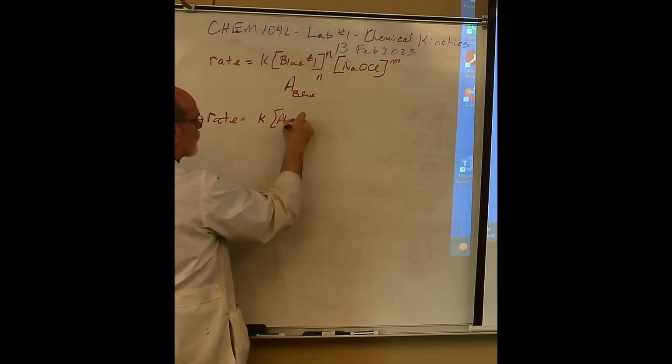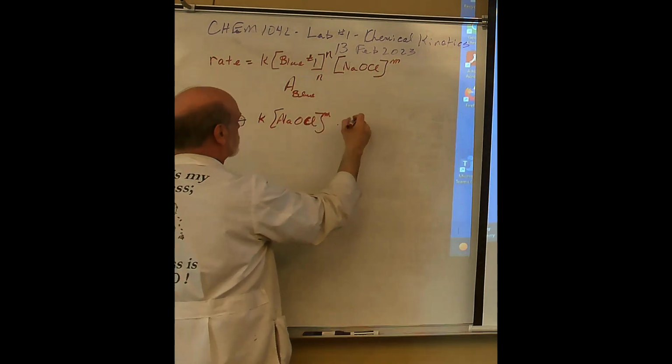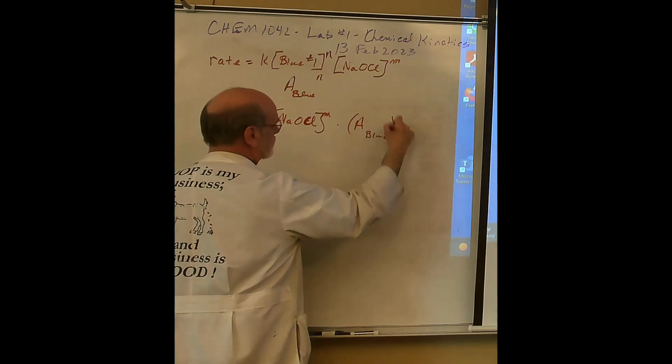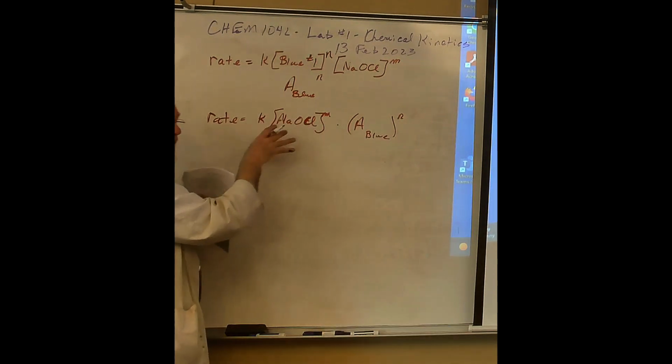Sodium hypochlorite to the M, now times the absorbance of blue to the N now. Okay, we make this one so high that it doesn't change.